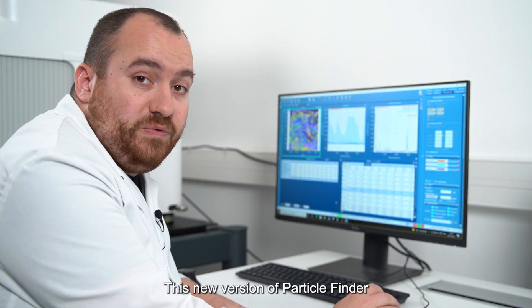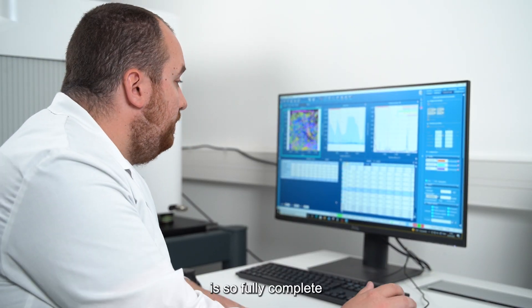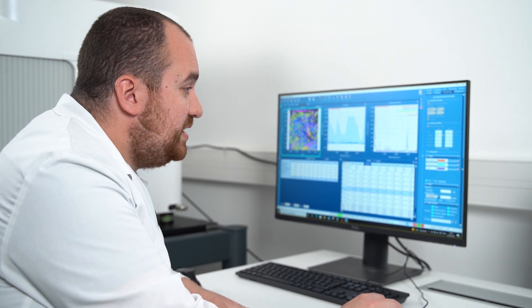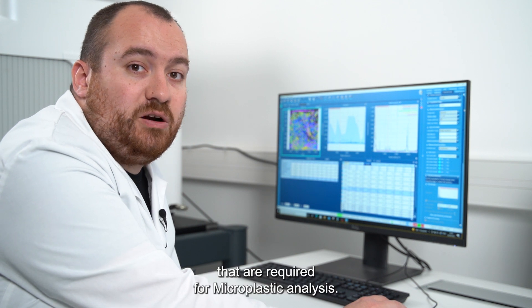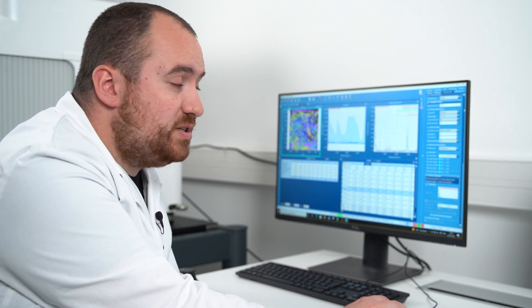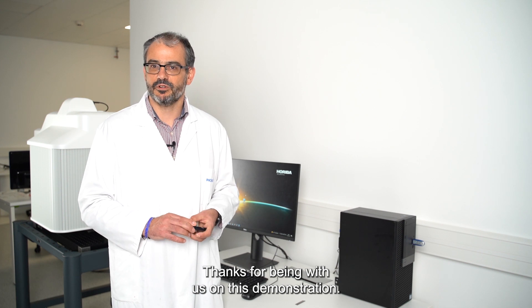Particle Finder is fully complete, giving you access to all parts of the analysis that are required for microplastic analysis. Thanks for being with us on this demonstration.